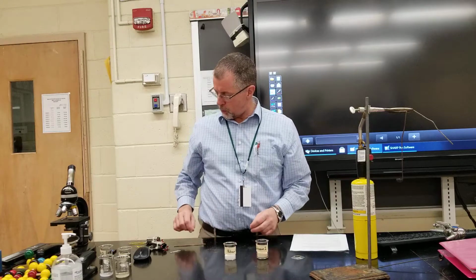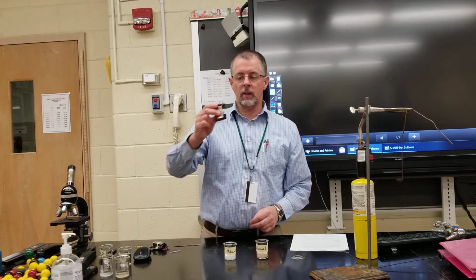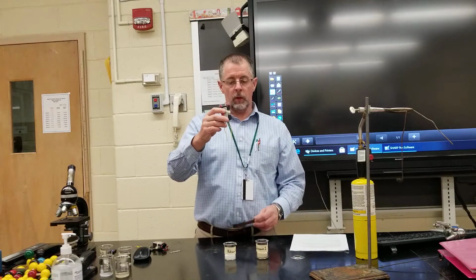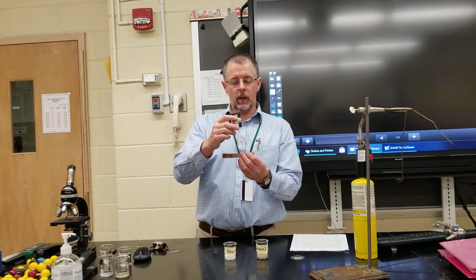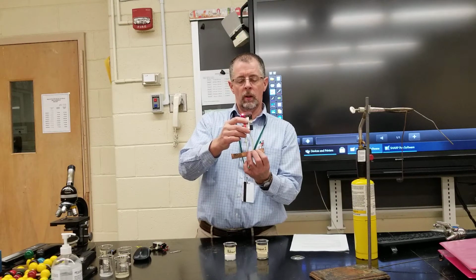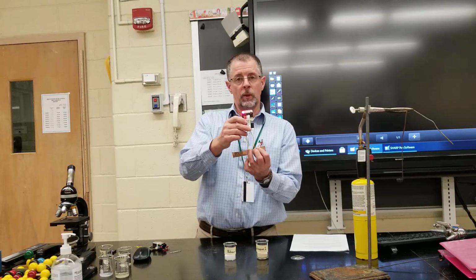In order to do the test, we're going to use what we call a conductivity meter. So to do this, we want to make sure the meter is working. I could simply touch the two electrodes to a piece of metal, and we see that it lights up, so this meter is working.